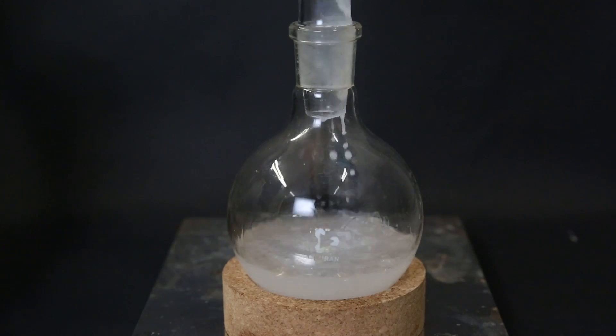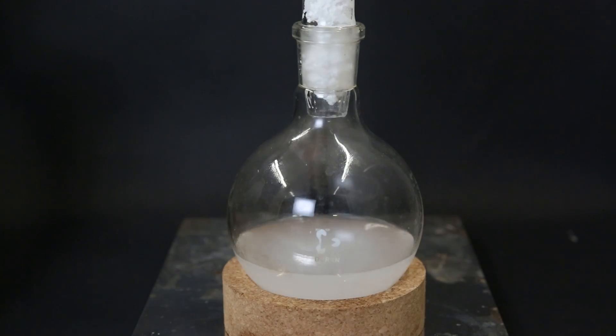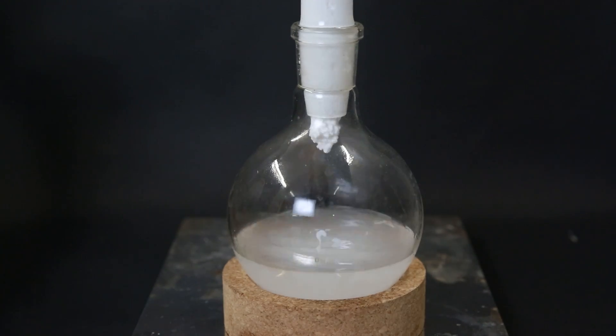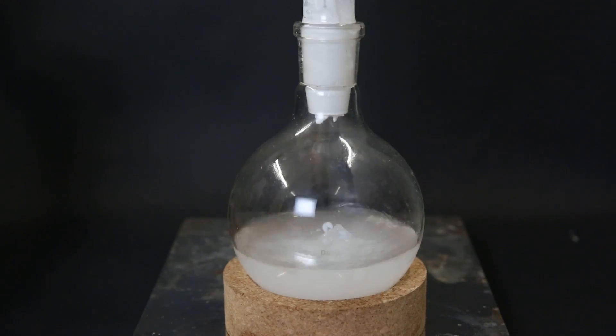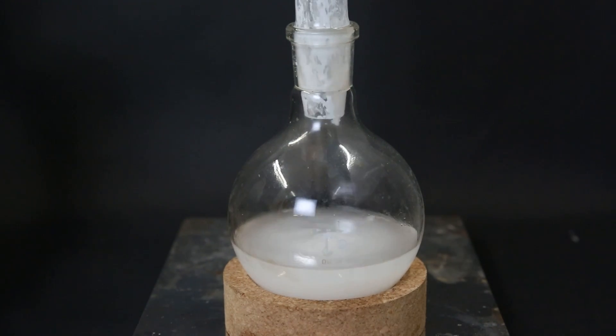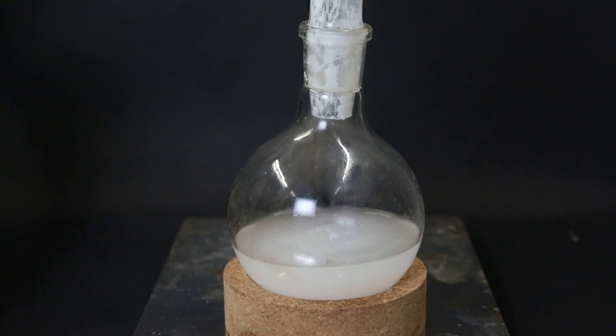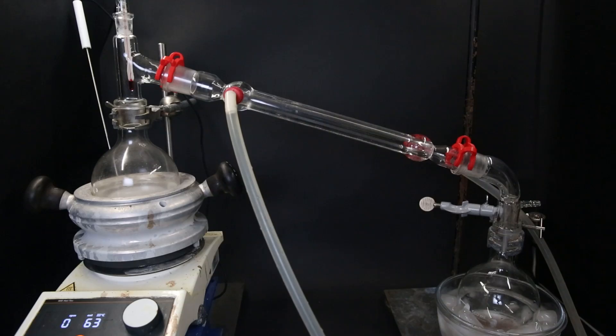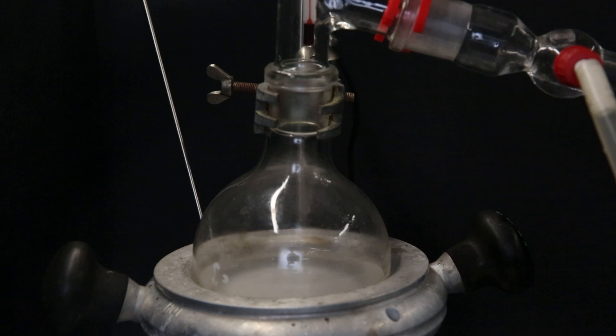I transfer all of the contents to a flask, including the calcium chloride. Since the boiling point of diethyl ether is so low, I can keep the calcium chloride in the flask while distilling without having to worry about the water coming over. So I set it up for a regular distillation and I don't have to add in a stir bar since the calcium chloride beads work nicely as boiling chips.